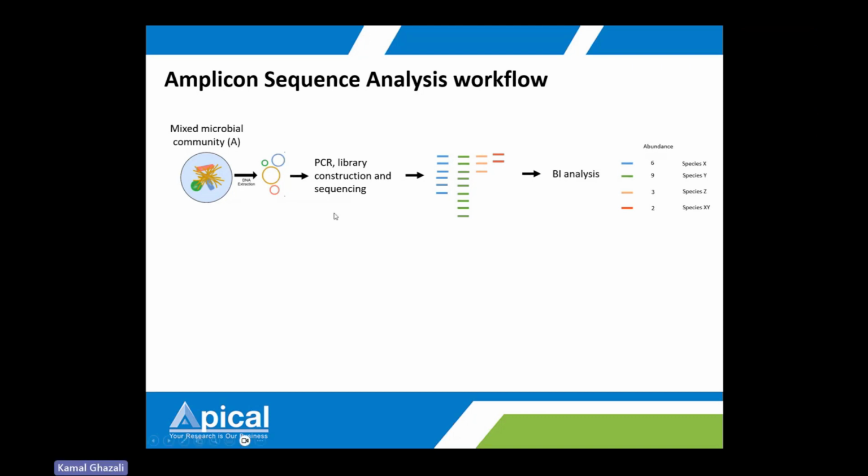So at the end of this phase, we generate sequence data. Using bioinformatic tools, the sequences are analyzed. First, we cluster all these reads according to sequence similarity and analyze them, to match their taxonomy and also to study the abundance of these microbes in the sample.